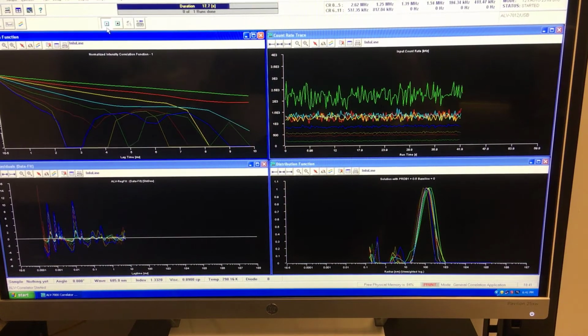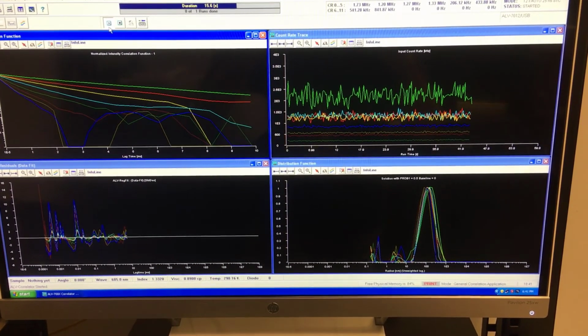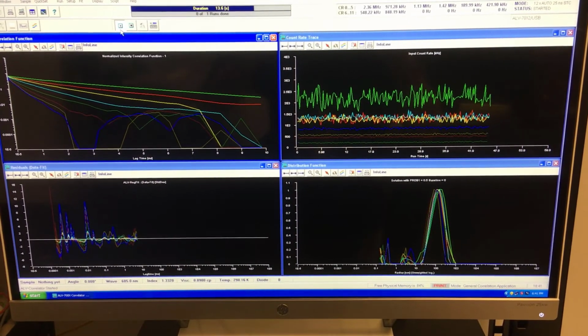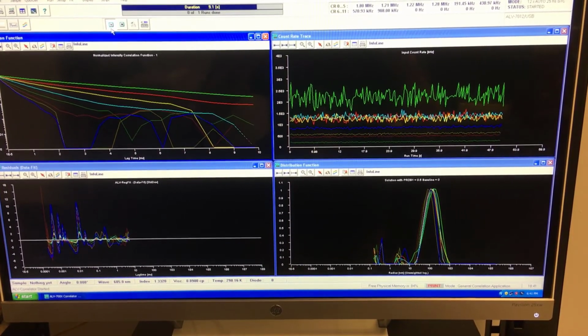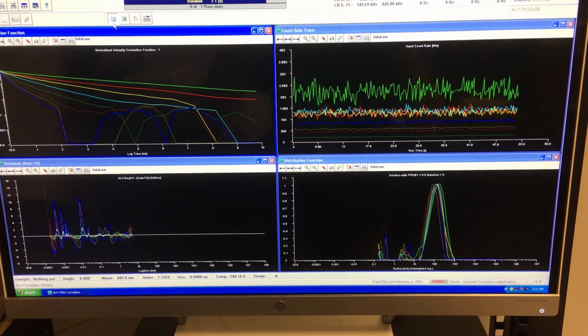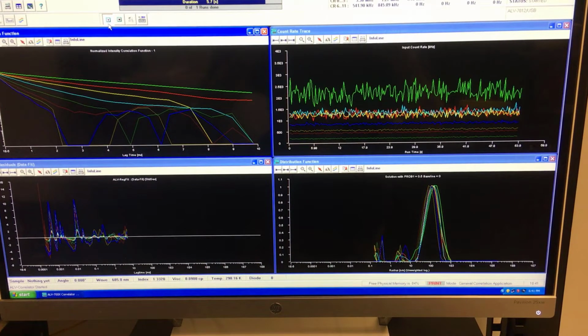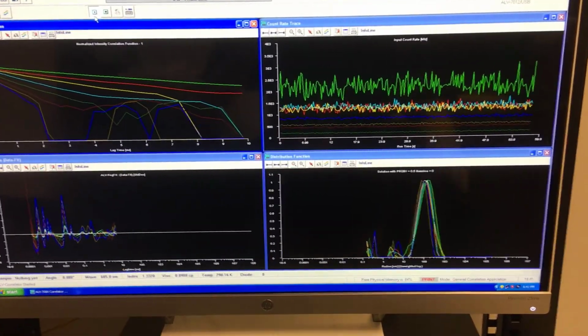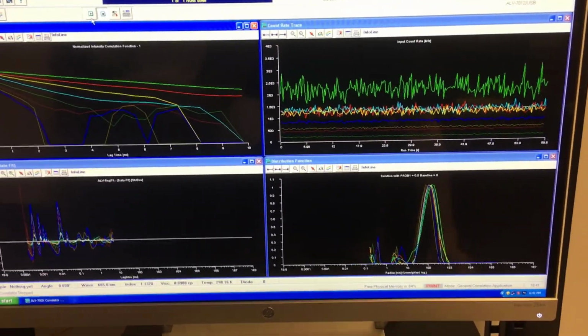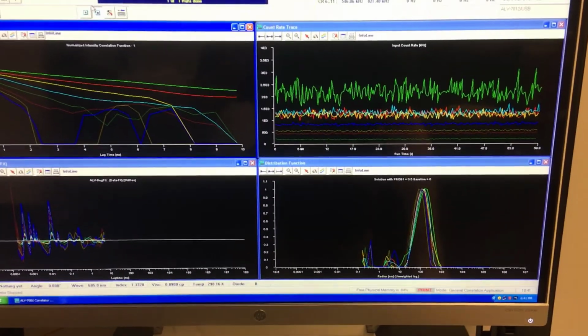At the higher scattering angles, the intensities have gone up and down many times, and so it sort of averages out. The correlator is recording those up and down intensity fluctuations properly. It's just that you can't see them. It doesn't display on this time scale, where they only show you every 400 milliseconds. So it's almost done running.